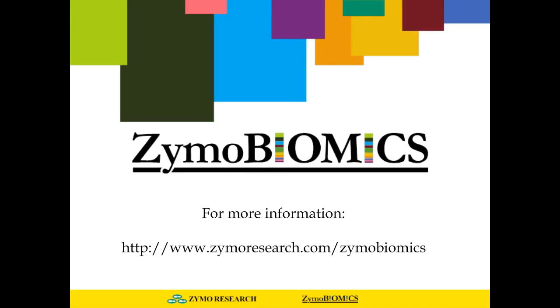How does GC content variation cause bias in sequencing coverage in shotgun sequencing? So currently, there is no perfect explanation to how GC bias occurred. Some reports have shown that it can come from the process of PCR amplification. Some indicate that it might come from the sequencing platform itself. But according to our results, because we don't see obvious GC bias in our internal library preparation process, we think that GC bias caused by the sequencing platform should be subtle if existing.